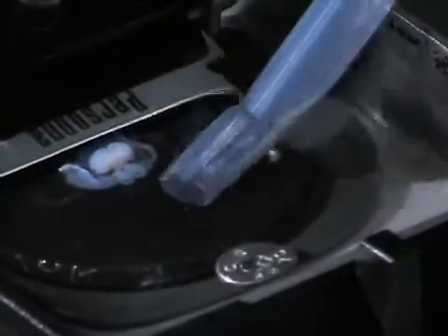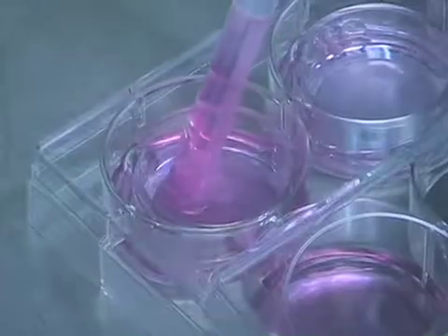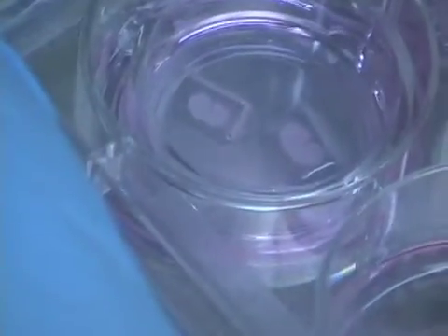This procedure involves dissecting the brains out, embedding them in low-melt agarose, then slicing them on the vibratome and taking your coronal sections and then placing them in the slice culture system.